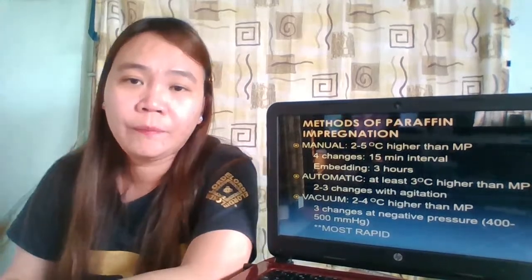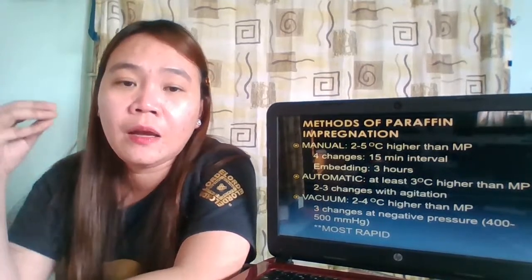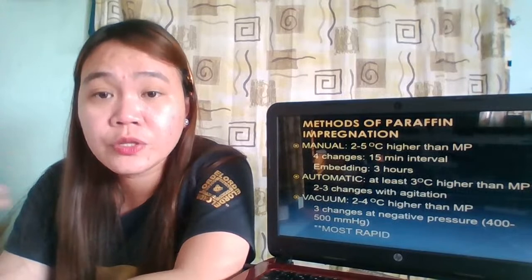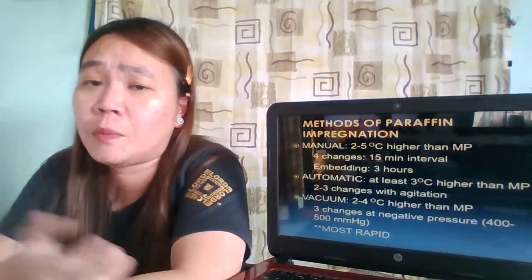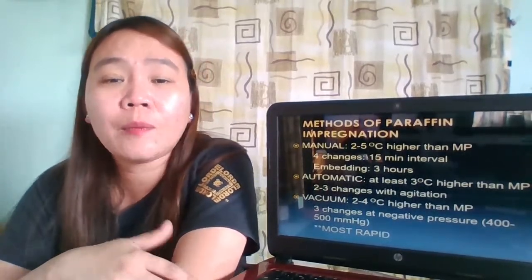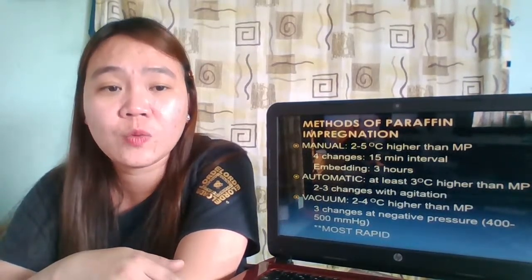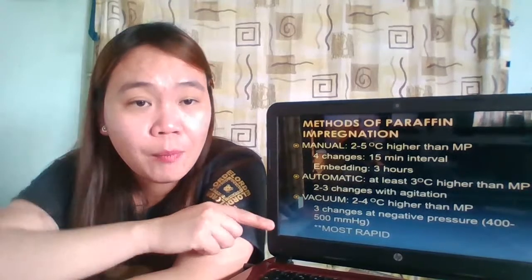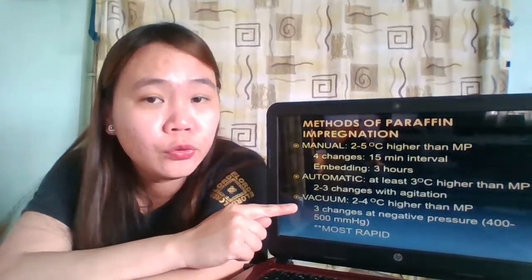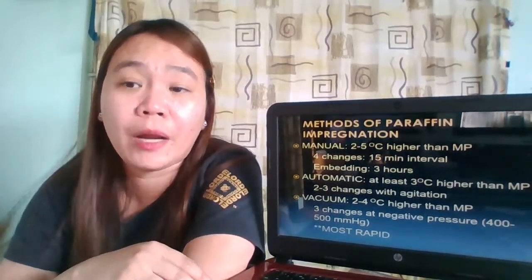So an advantage of automatic over manual paraffin impregnation is that the results are more consistent because of the agitation. Since agitation accelerates and improves penetration, automatic processing requires fewer changes: 2 to 3 changes compared to the 4 required for manual processing.